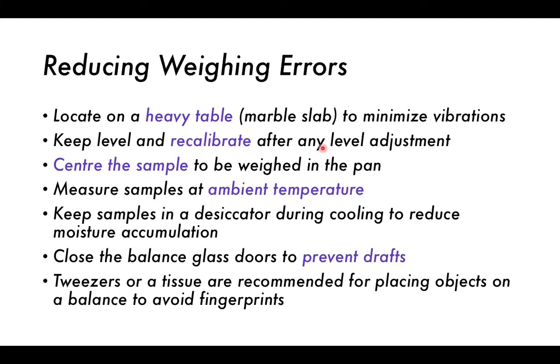Keep level and recalibrate after any level adjustments. So if we are going to move or change the location of the electronic balance, it's important that it has been recalibrated after any level adjustment. Always make sure that the sample is centered on the weighing pan.